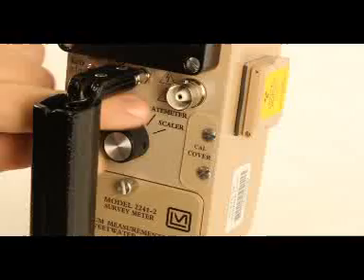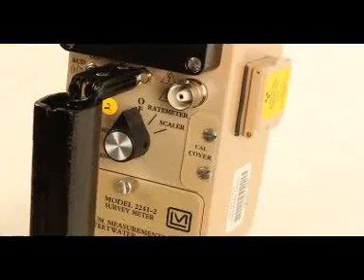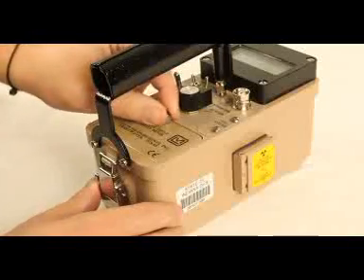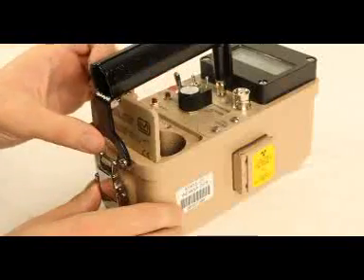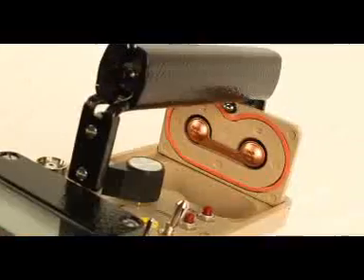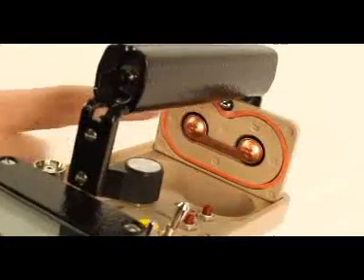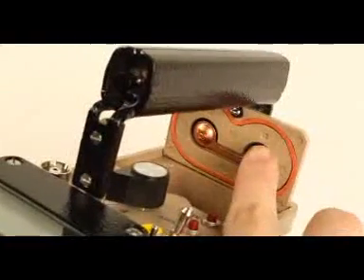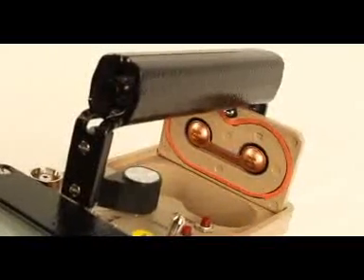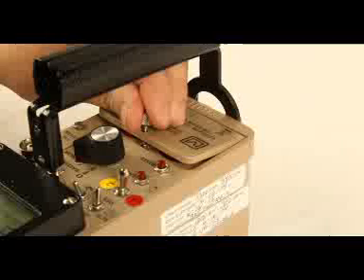Ensure the off-scalar rate meter switch is in the off position. Open the battery lid by turning the quarter-turn thumb screw counterclockwise. Install two D-sized batteries into the compartment. Note the plus and minus marks inside the battery door. Match the battery polarity to these marks, close the battery box door, and turn the thumb screw clockwise to lock.